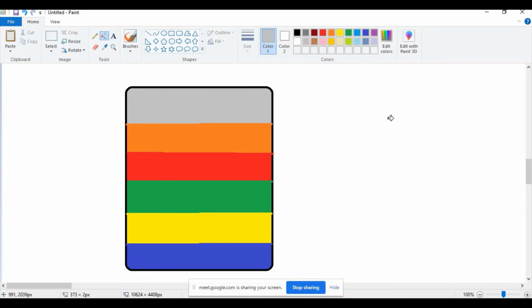Now, one question you may ask: here I have added the sucrose solution of more concentration, and over it I am adding sucrose solution of less concentration. Why do these two layers not get mixed, because they are the same sucrose? This is the important property of the sucrose and cesium chloride solution. These layers of different concentrations of the same compound do not get mixed because of the high surface tension. This surface tension is high, and that is why all of these layers will not get mixed.